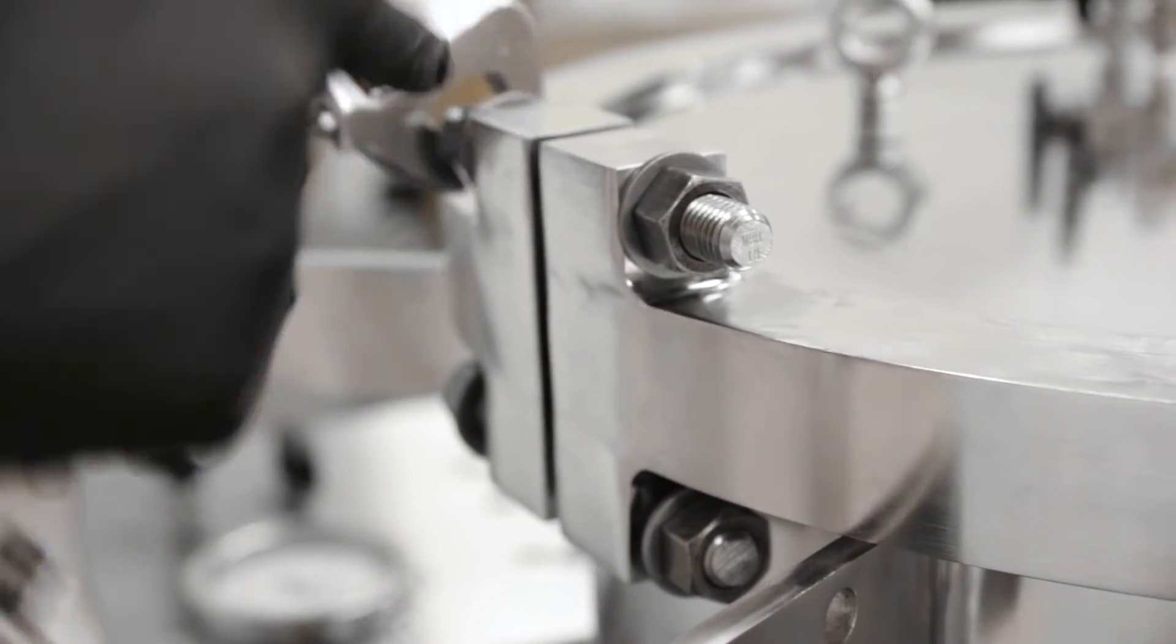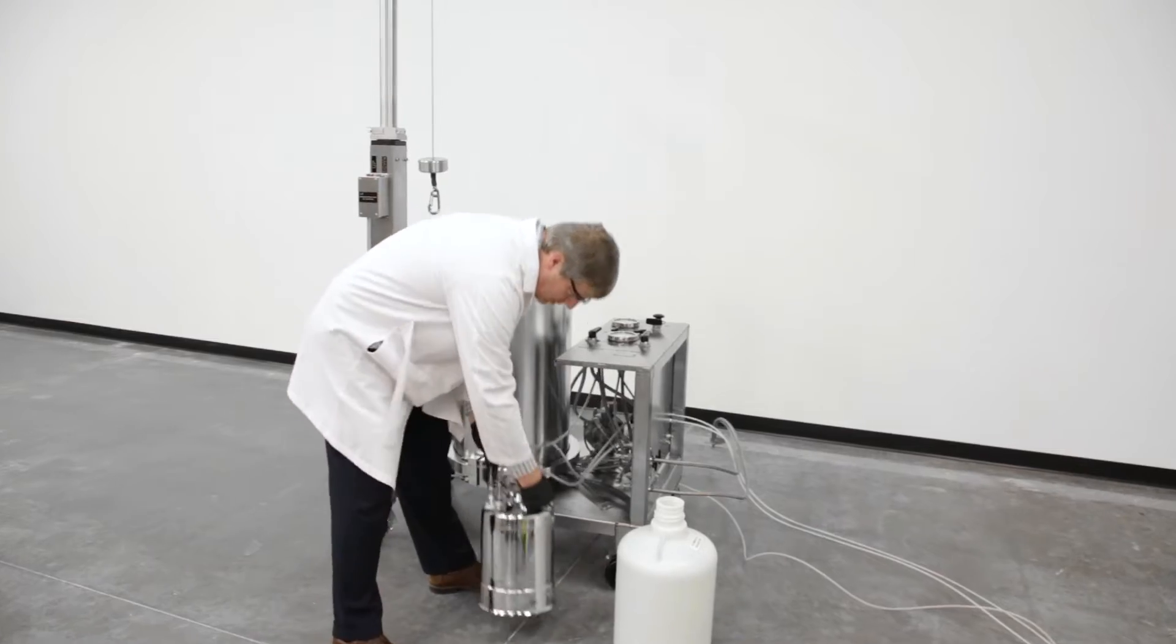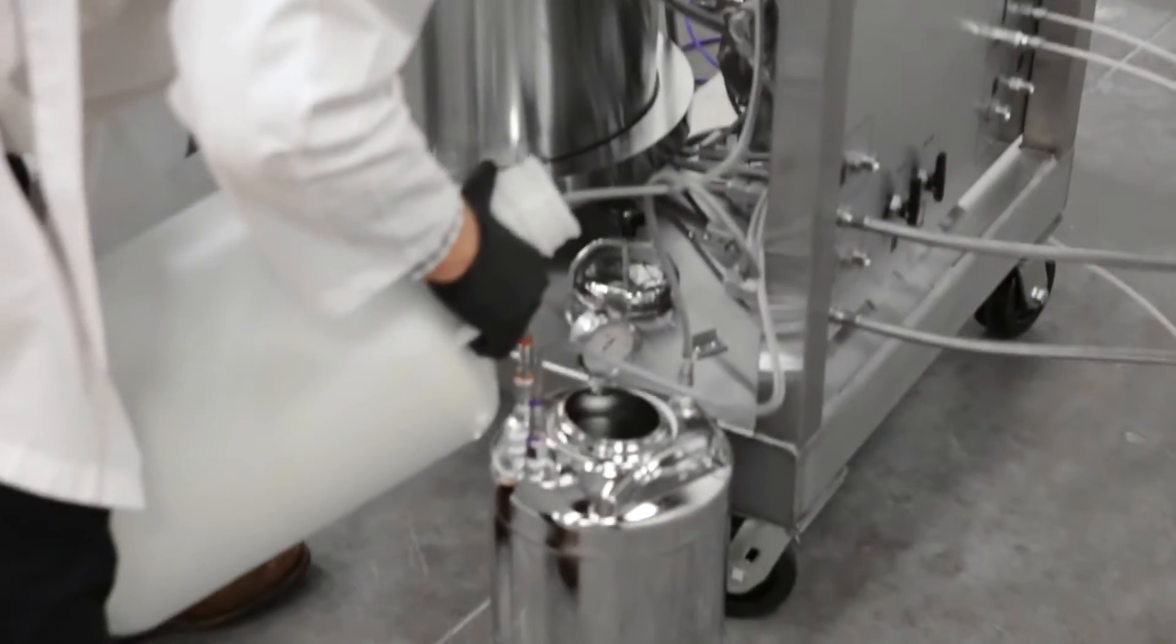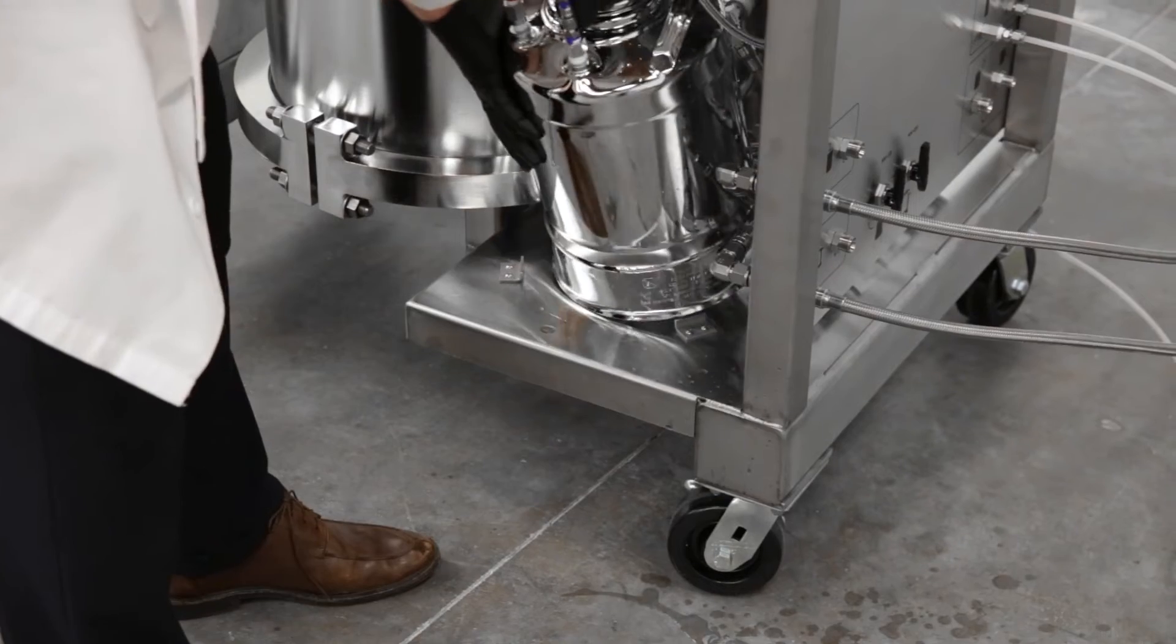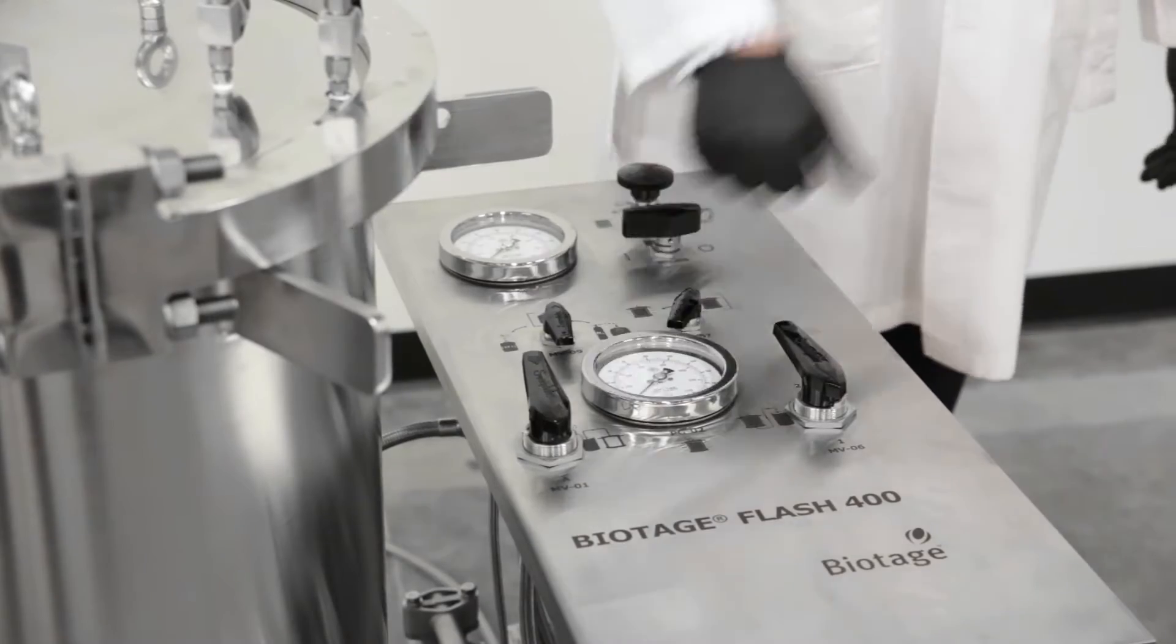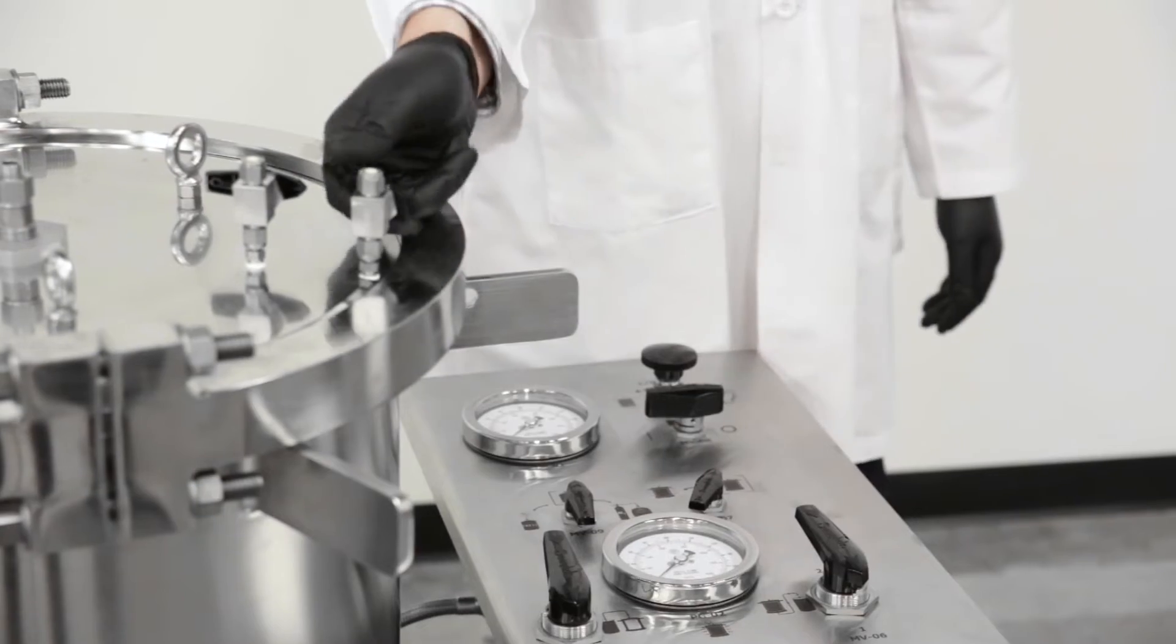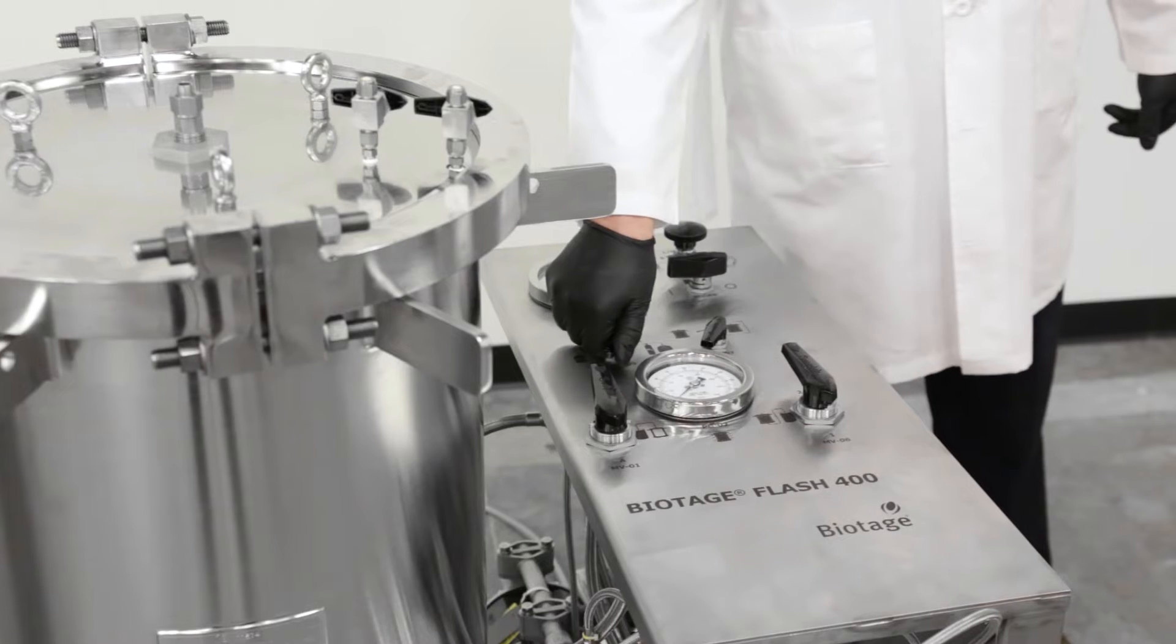With the cartridge securely in place, the radial compression can be prepared by filling the reservoir with fluid. The compression module is then sealed off with the valves located on the panels and head.